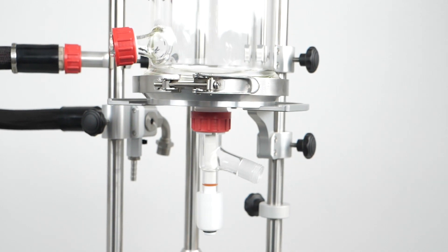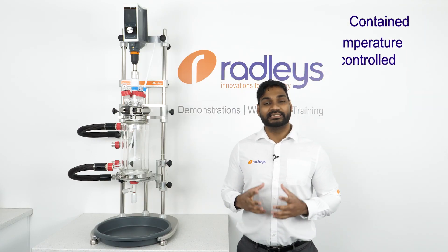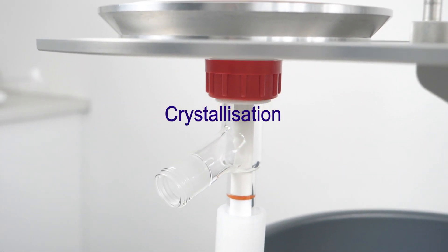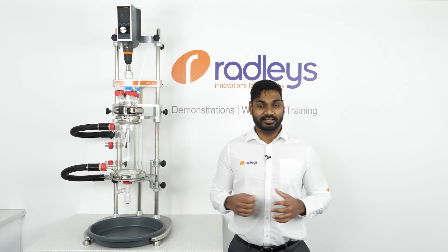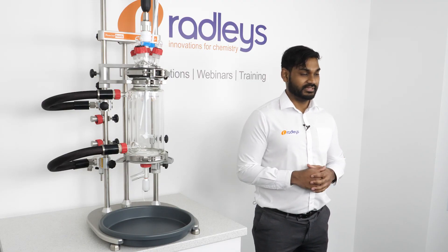The concept of our filter vessels is that they allow the user to perform reaction and filtration in one vessel, allowing for contained temperature-controlled stirred filtration. This is ideal for applications such as crystallizations, where you can perform your reaction, precipitate your product out in the vessel, and then your product can be filtered, washed, and dried all in situ.